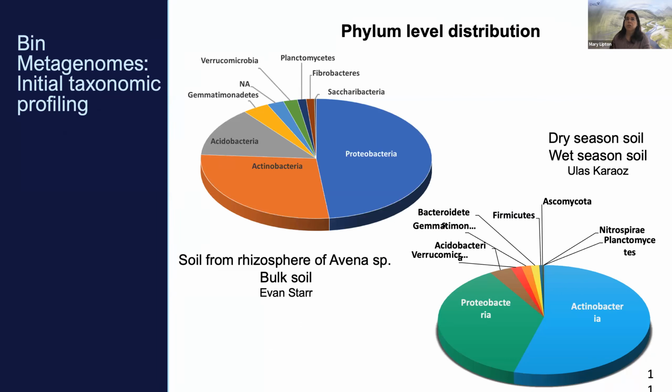But if we take it and compare it to what is actual, it's actually quite interesting, because proteobacteria should have dominated, because there's more proteins in the proteobacteria than all the rest of them, according to our pie chart. But we don't see as many. We see fewer proteobacteria than actinobacteria. So that means that even though the proteobacteria should have had a bigger component to our system, the actinobacteria actually did. And the acidobacteria is really a lot smaller. And then the pies for the rest of them are what we would expect.